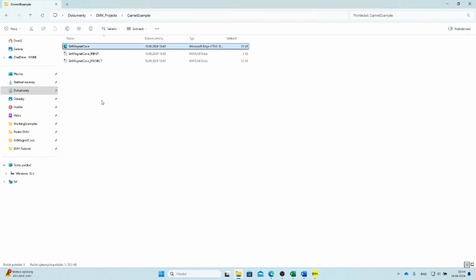It's opened automatically using a web browser. Just to assure you, this takes place offline, so no data are uploaded to the internet. The reason for choosing this file format was that it nicely displays formulae, including subscripts and superscripts, and it can be easily opened and edited using text editors such as Microsoft Word, for example.